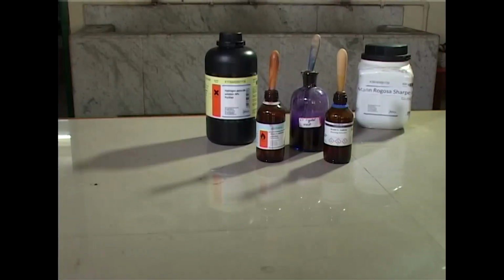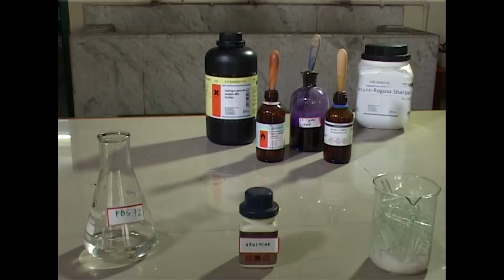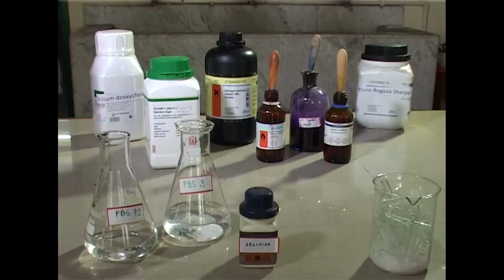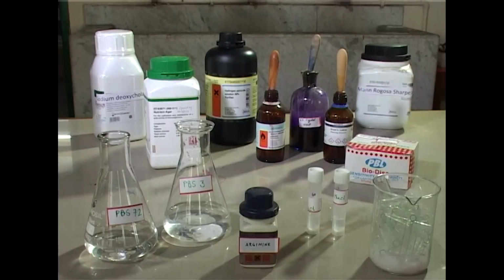Materials required: the curd itself, specific selective media like de Man, Rogosa and Sharpe agar or MRS agar, gram stain, 3% hydrogen peroxide for catalase assay, Durham's tube, 0.3% arginine, phosphate buffer saline PBS at pH 7.2 as well as pH 3, bile salt like sodium deoxycholate or taurocholate, nutrient agar disc as well as sodium chloride in different concentrations.